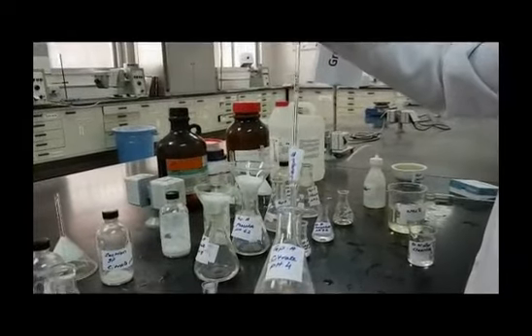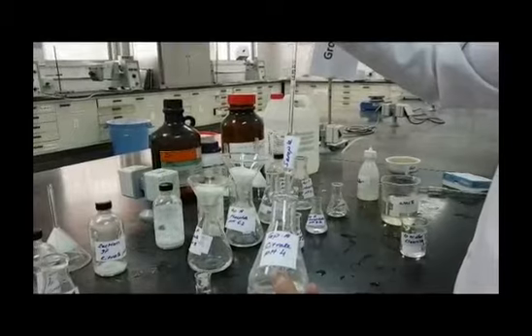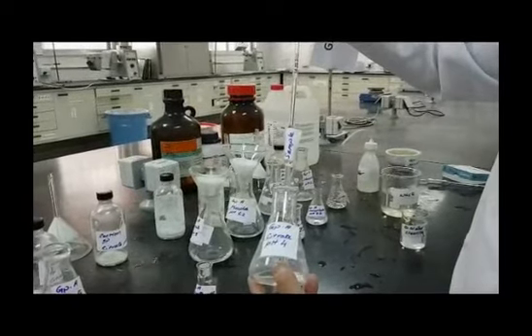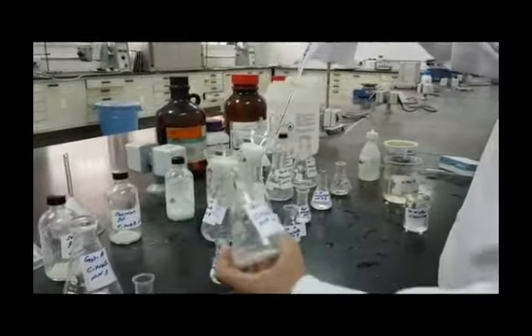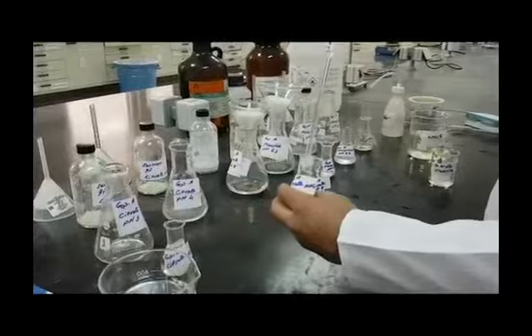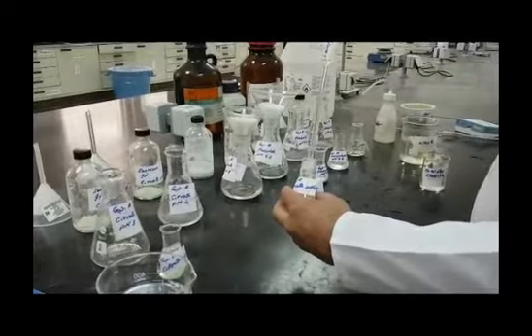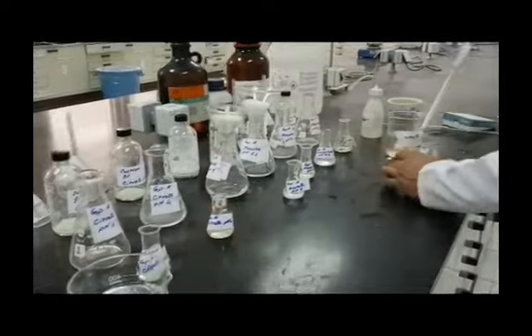Please maintain a very well organized, ordered working area. This will make things much easier for you, and you will always be in complete control of your work. You will be evaluated based on this.